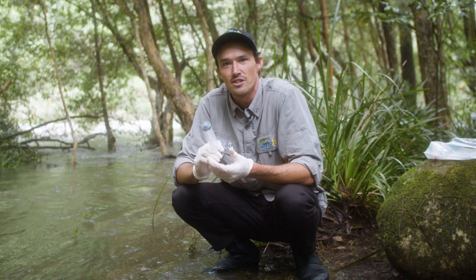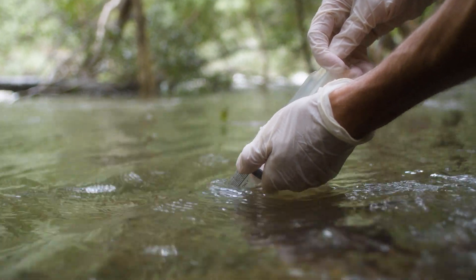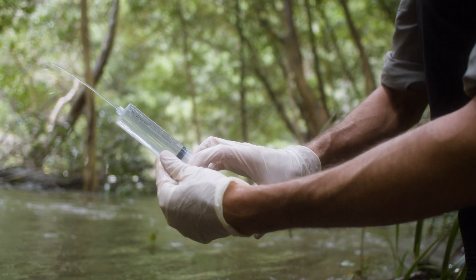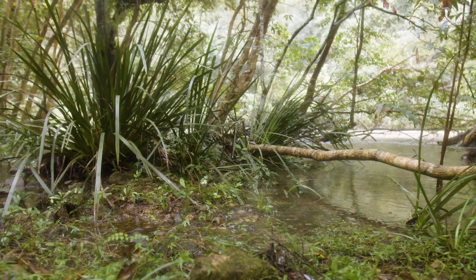The next step is to grab our syringe and take a sample of water. We want to make sure we don't get any weed or sediment in the sample, make sure there are no air bubbles, and then empty it so there's only 50ml remaining. That's because we need to record the exact amount of water we're filtering, and 50ml is a nice round number.